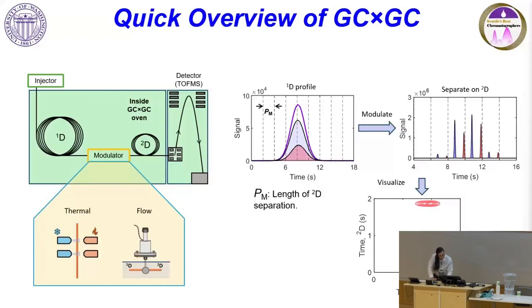And here, again, already covered, as we capture things from the first dimension, we can use our orthogonal separation on the second dimension to separate those analytes. And you can consider it as a kind of unfolded chromatogram, but we tend to use folded chromatograms just for visualization purposes.